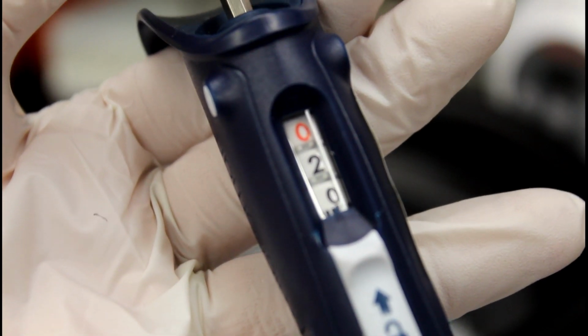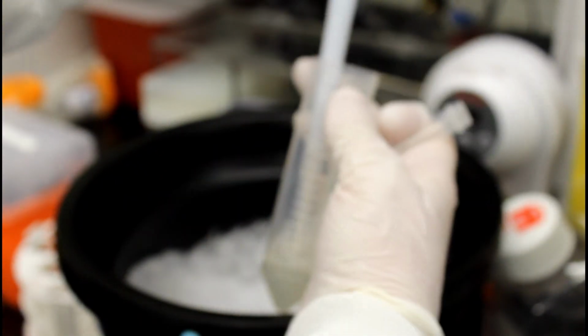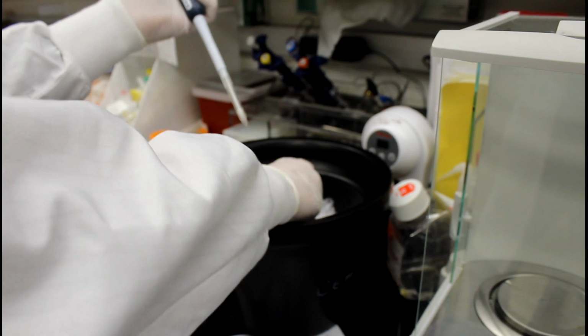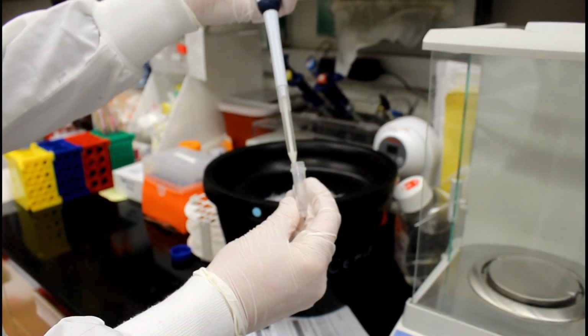The easiest way to do this is to use a 200 microliter air displacement pipette and draw up whatever can be achieved. The exact volume isn't important, but using a 200 microliter pipette will ensure that anywhere between 0.05 and 0.2 grams will be captured.